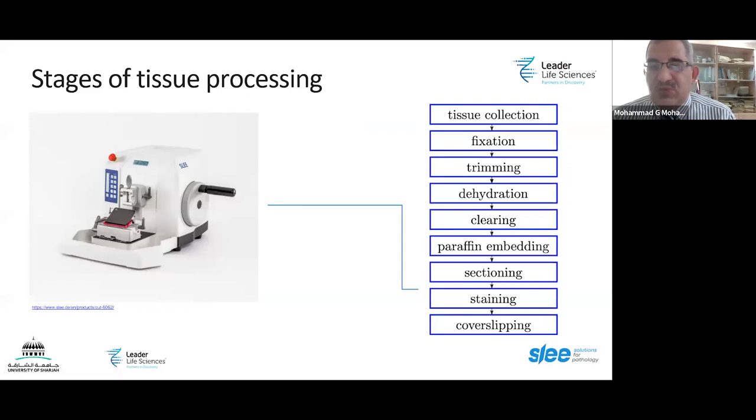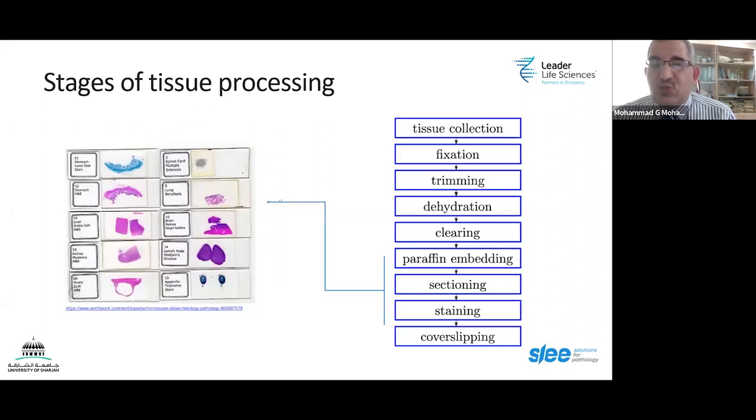In the microtome, the blocks that were placed in paraffin are supported in order to get thin sections, maybe 5 to 10 micrometers thick, which makes them very suitable to be stained later and ready for examination by the pathologist. Throughout this process, the tissues are prepared carefully. Many conditions, factors, and variables need to be checked at every step, because every mistake can result in variation in the tissue later on.